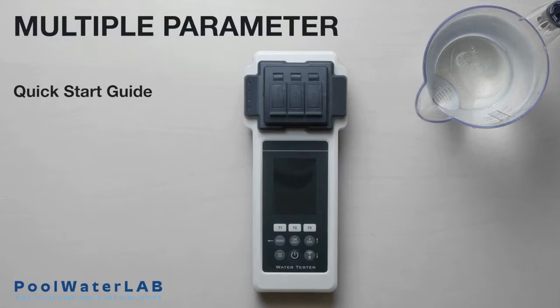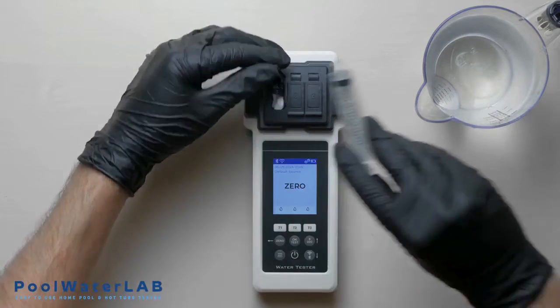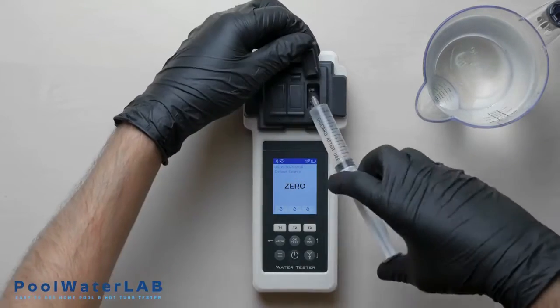Turn on the water tester using the power button. Do not touch tablets with your hands during testing. Add a water sample to all three measuring chambers with a special syringe, exactly 10 milliliters in each.